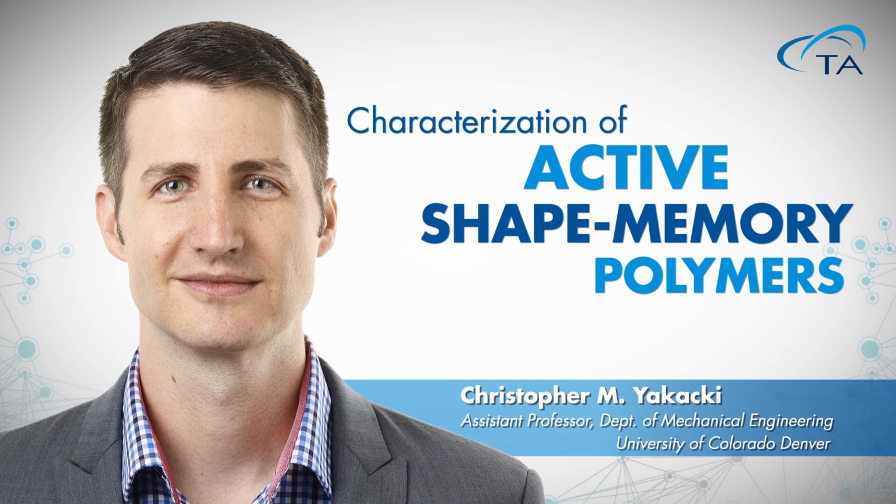Normally, most of my research is focused on amorphous networks, so those amorphous materials shift with TTS very nicely. But when you have materials that have crystalline domains, as you go through those melting transitions, it can go off the rails a little bit. So you should be careful about what type of material you're shifting with TTS.